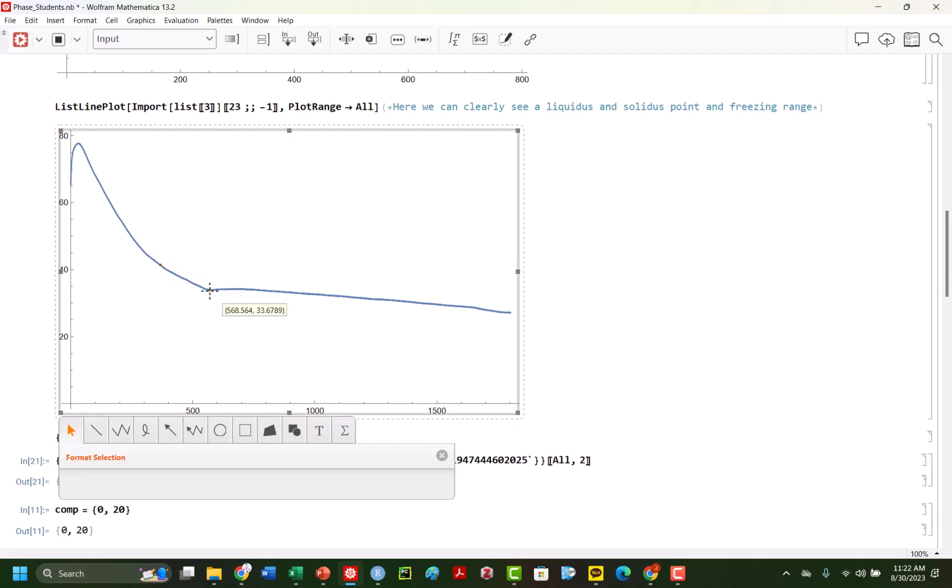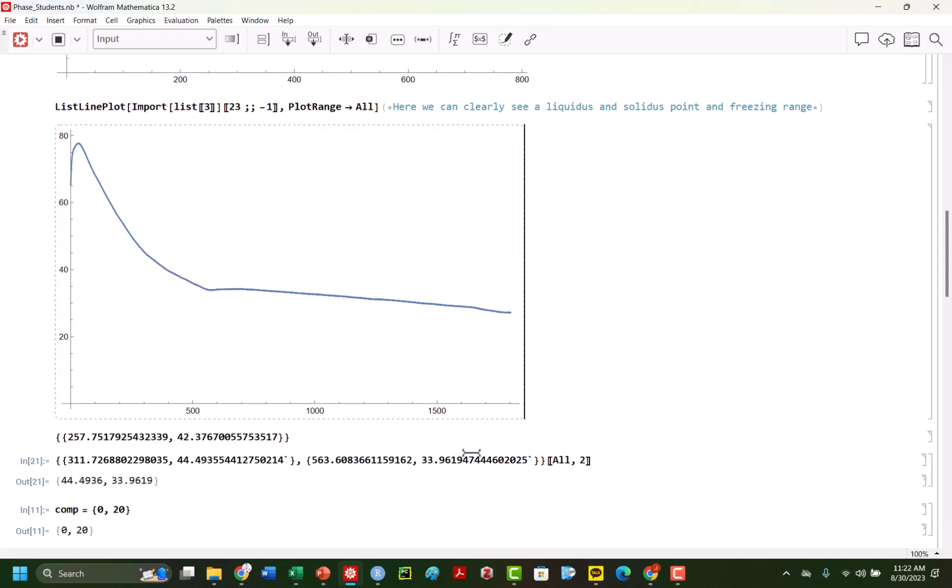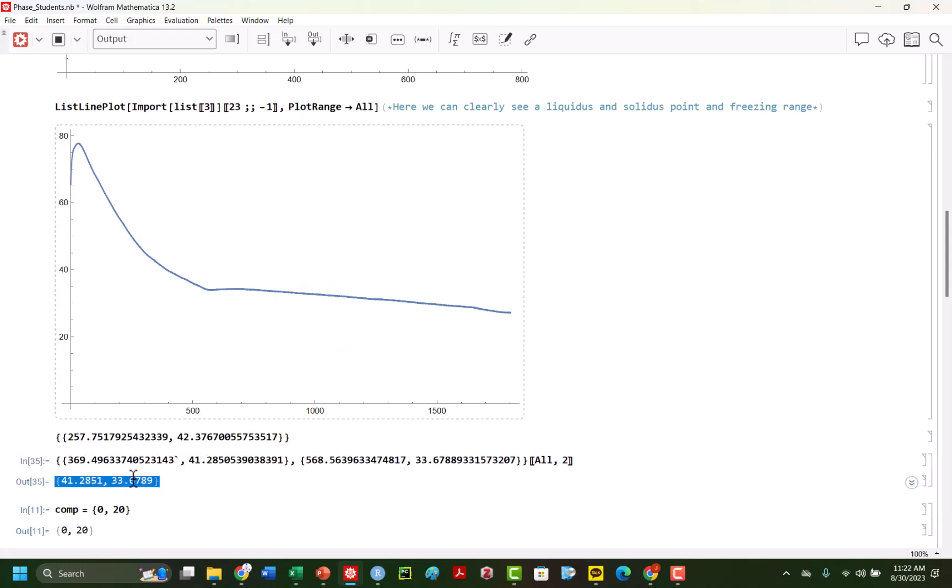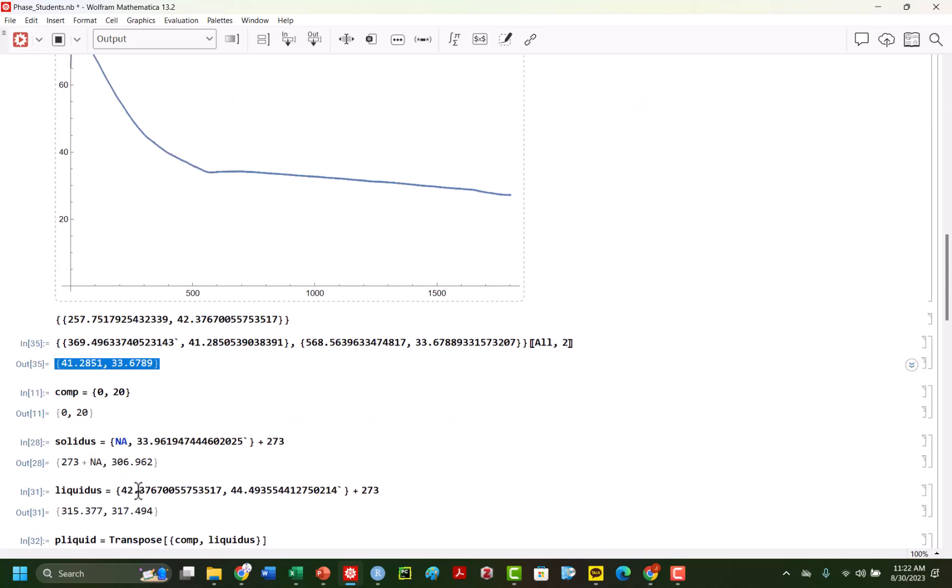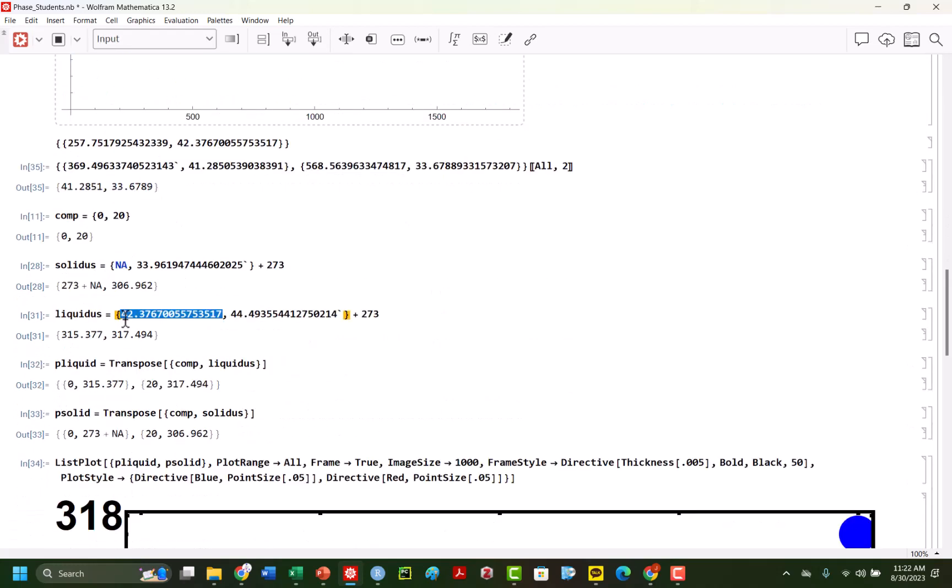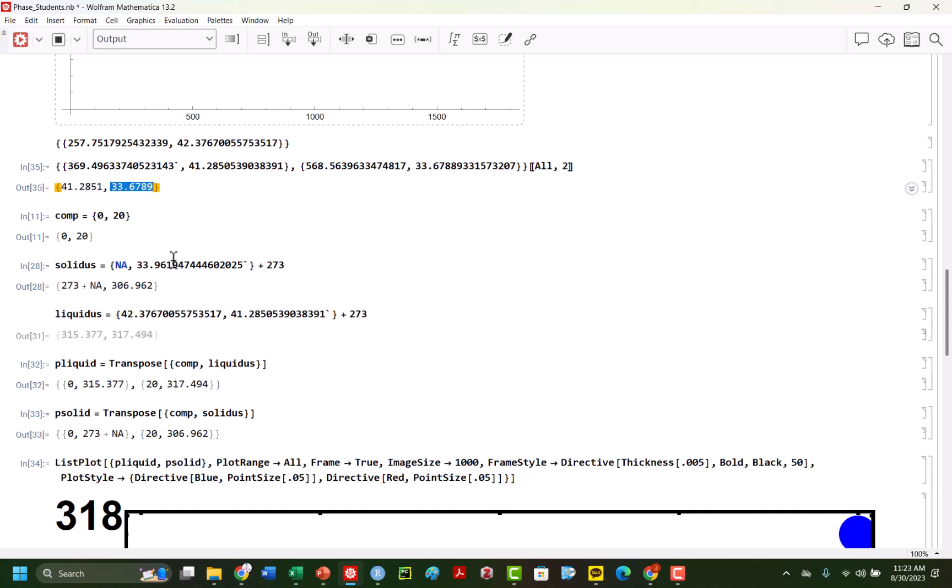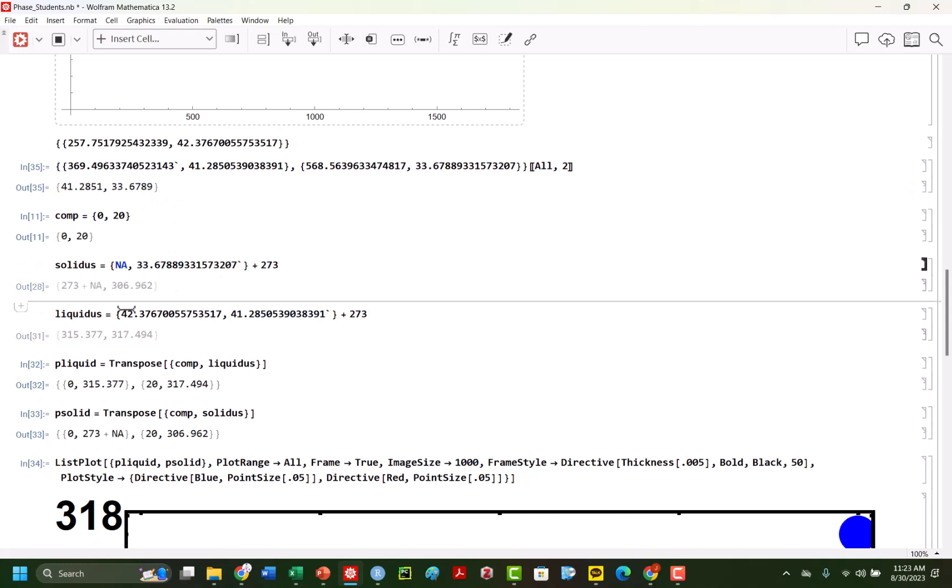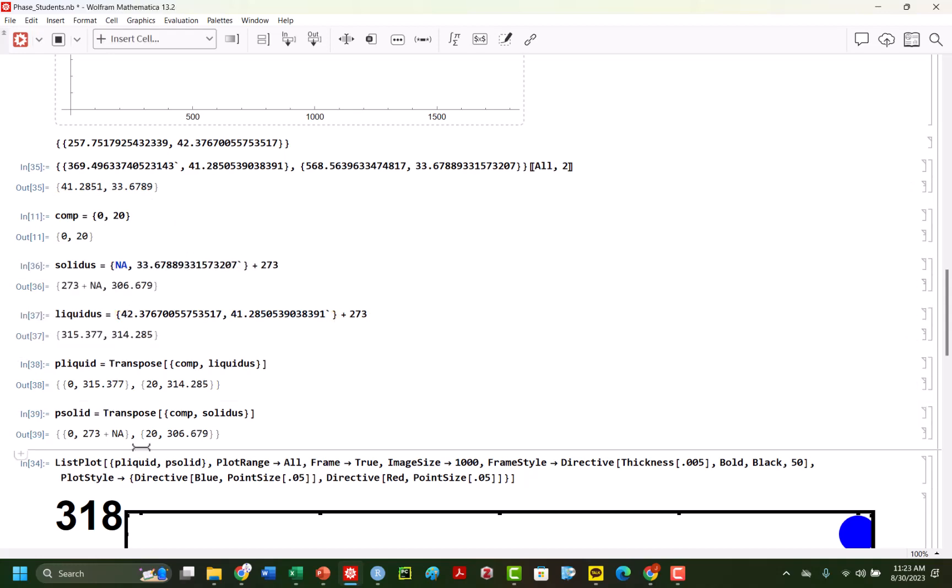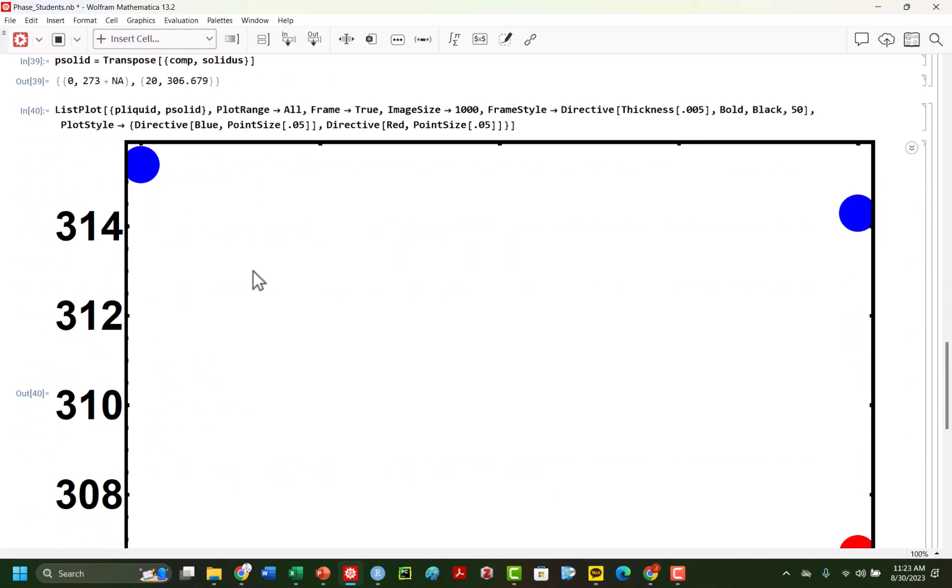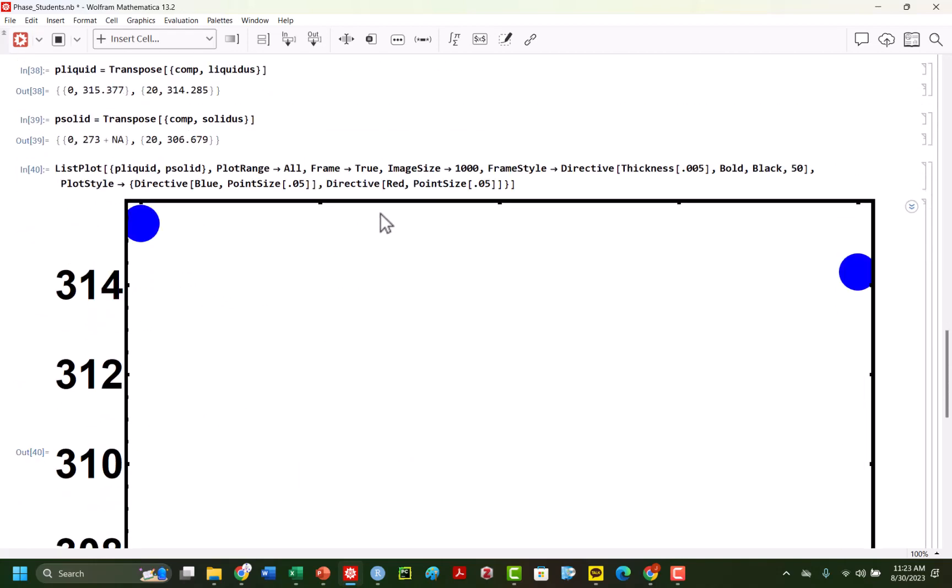It's starting to really see that alliteration right here and here. So again, I'm just trying to see, I mean, again, getting a better idea of where that slope is. So I'm just going to pull this up here. I'm going to do this here. Again, it's not a huge deal. There's going to be some amount of error in here. So we're going to do, that was from this. Let's put this one here. Let's put this one. This one's pretty accurate, so it's very similar. Again, you're kind of seeing, again, you may want to kind of go back and look through, kind of this data set.